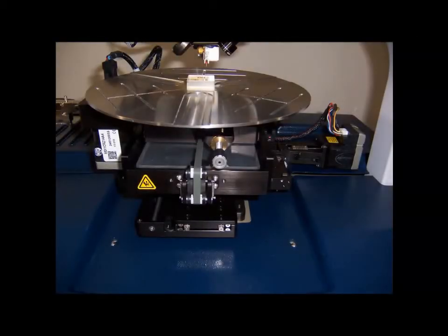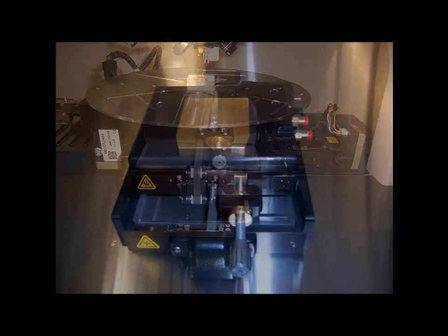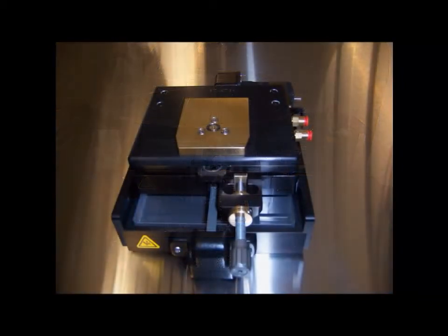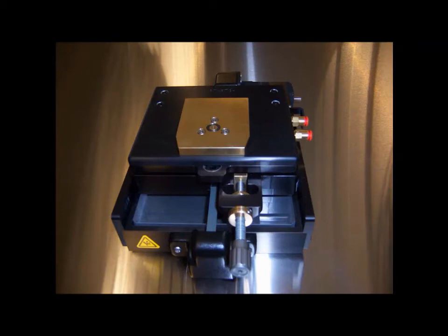At the heart of the base stack is the scanning stage. The scanning stage has 55 mm of travel distance. If the system is equipped with an automated XY stage, scan stitching can then be used to increase the total scan length to 200 mm.